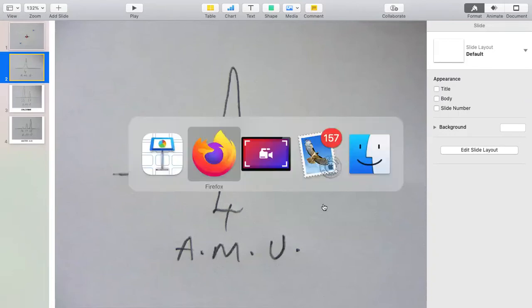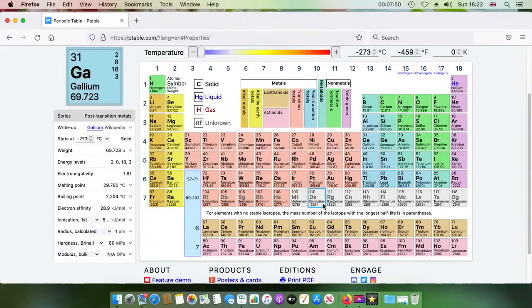Now, looking back at the periodic table, on this simple way we're looking at things, things have integer weights. Well, historically, when the periodic table was first being put together, it seemed to fit with what was thought to be the theory that the elements discovered seemed to have integer weights. And then one was discovered, chlorine here, and chlorine's got a weight of 35.45, and that caused a lot of confusion because this didn't seem to make sense.